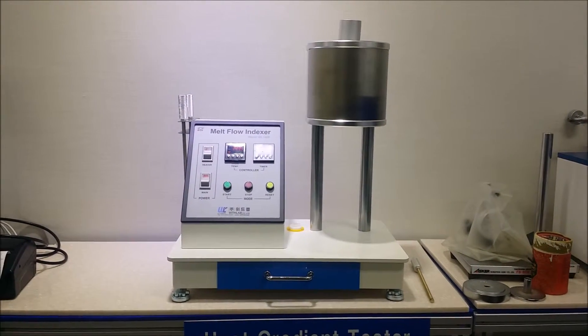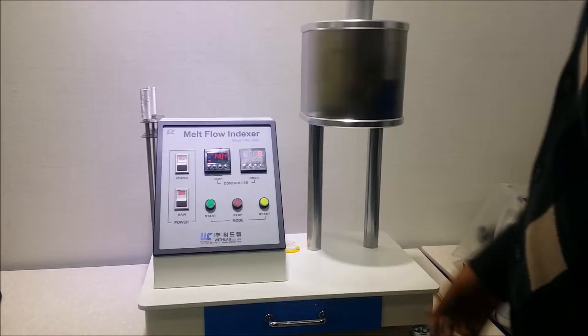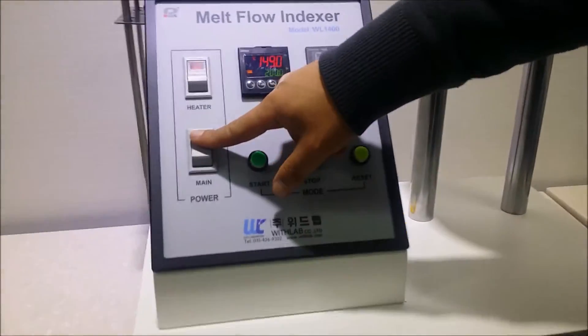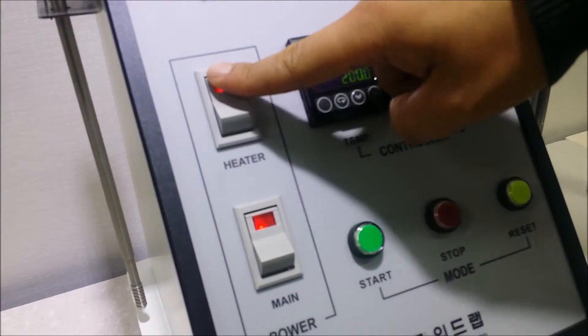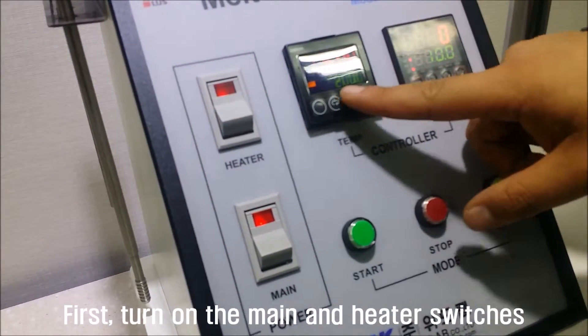Instructions on how to use the melt flow indexer. First, turn on the main and heater switches.